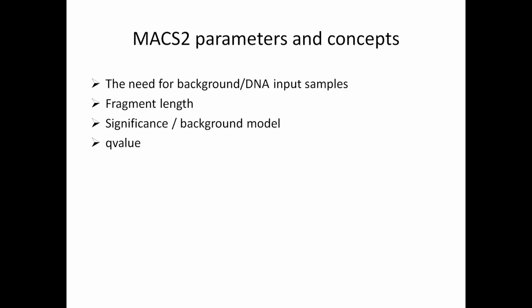The Benjamini-Hochberg qvalue replaces the previous empirical FDR value, false discovery rate. Both methods, though, are a way of controlling for multiple testing in the same experiment.